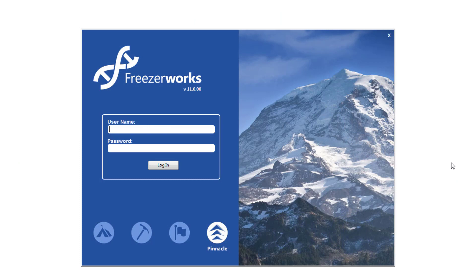Hey guys, welcome to the FreezaWorks 2019 learning series, your visual guide to our sample management software. So you'd like to upgrade to FreezaWorks 2019 — well that's wonderful. We've done so many things with 2019 that we'd love for you to implement as soon as possible. To learn more about those things, see our What's New video.